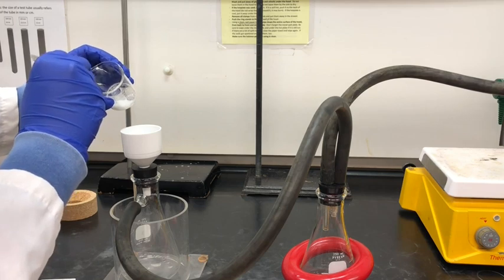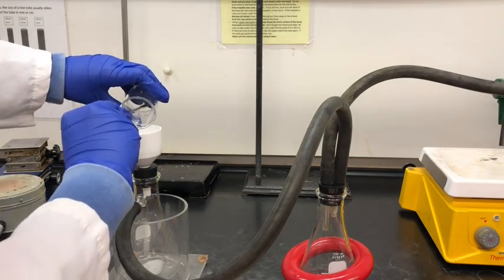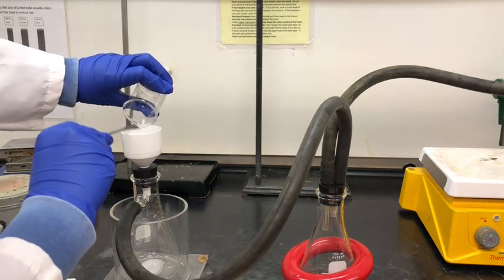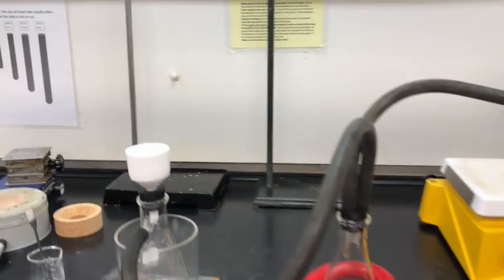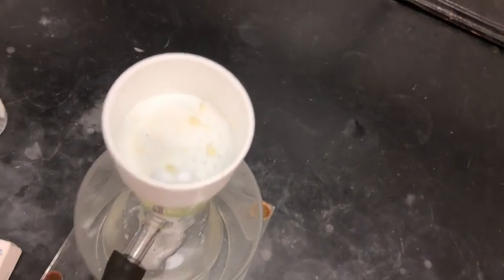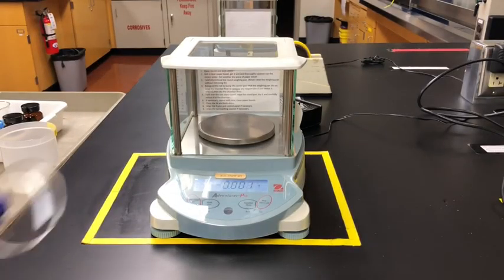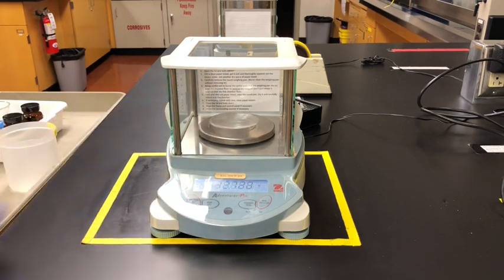Now I'm using a small spatula to help remove the crystals from the small beaker. After some careful scraping I managed to remove the majority of the crystals into the Buchner funnel — it's okay if some crystals are left behind as we can use those for our TLC plate later. Let's note the crystals' appearance: they are pale yellow in color. While I'm waiting for the crystals to dry, I'm going to weigh a watch glass and then eventually transfer the crystals onto it, so I can get an accurate weight for the crystals themselves.